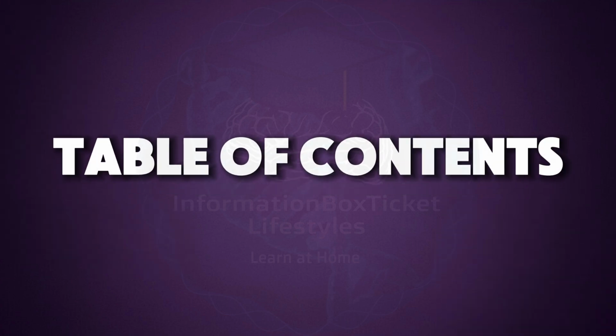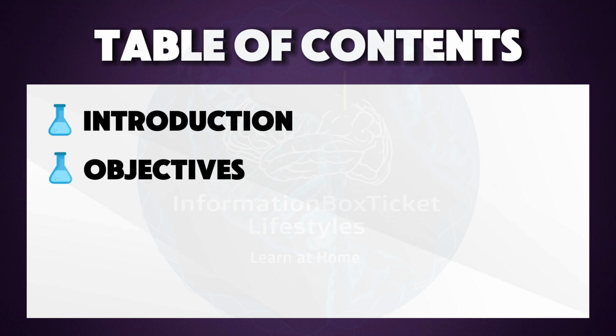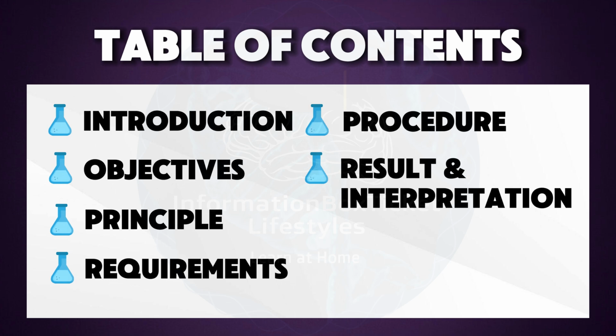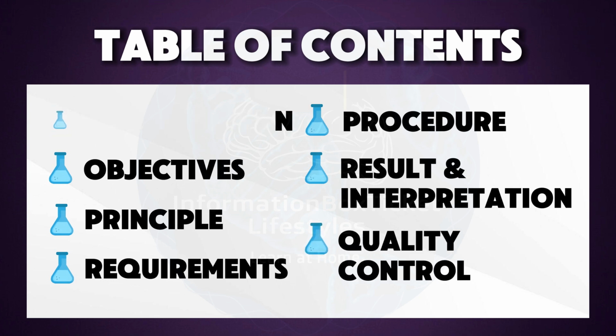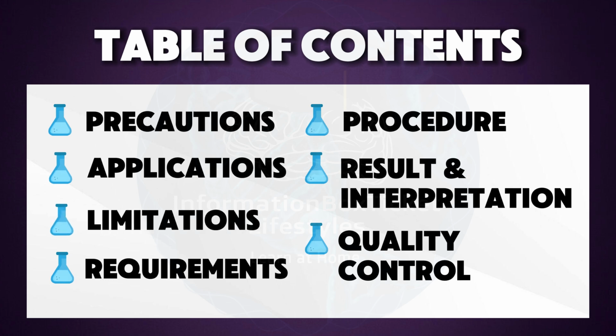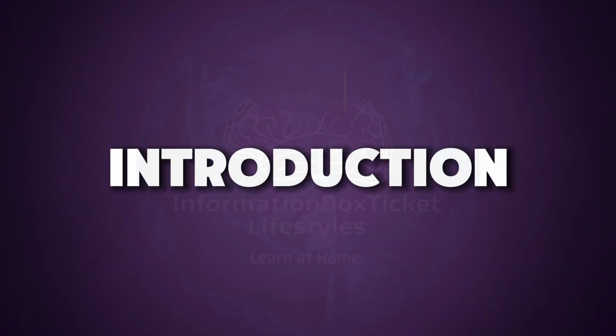Table of contents. Introduction. Objectives. Principle. Requirements. Procedure. Result and interpretation. Quality control. Precautions during oxidase test. Applications. Limitations. Introduction to oxidase test.